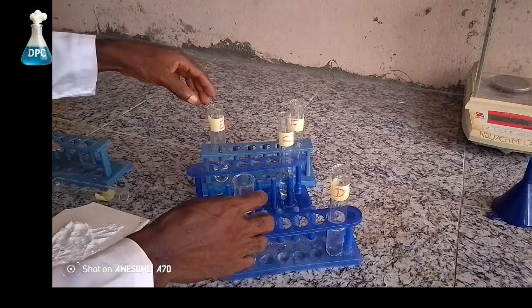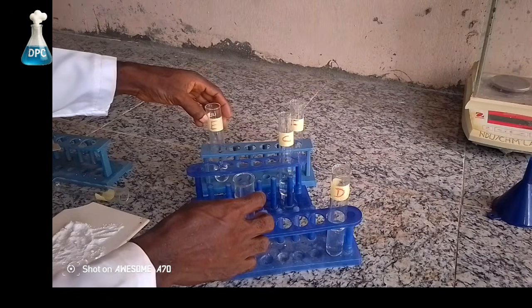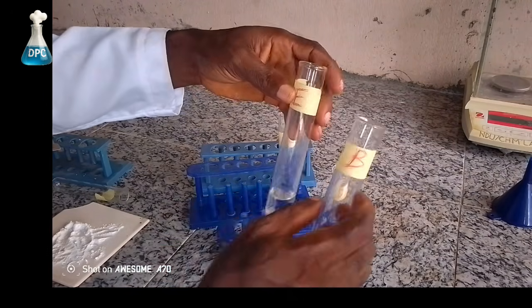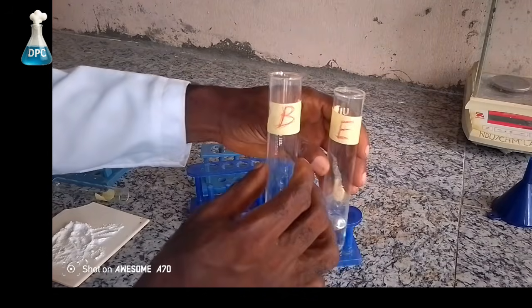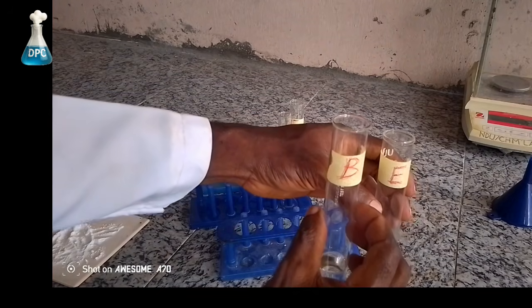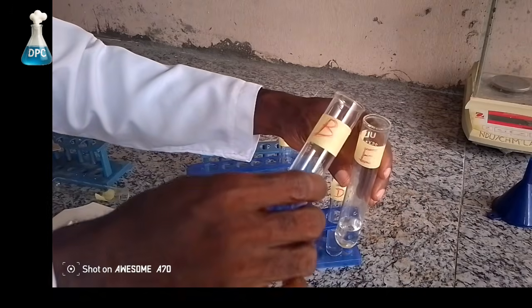We can now pour solution B into solution E and observe. While observing, don't forget to compare the rate of bubbling.